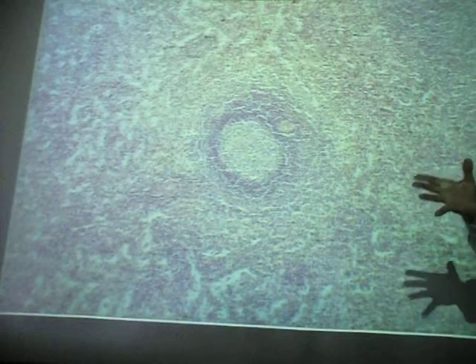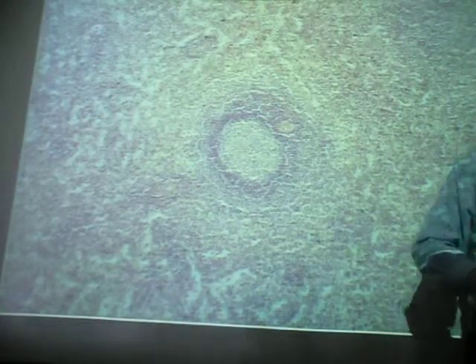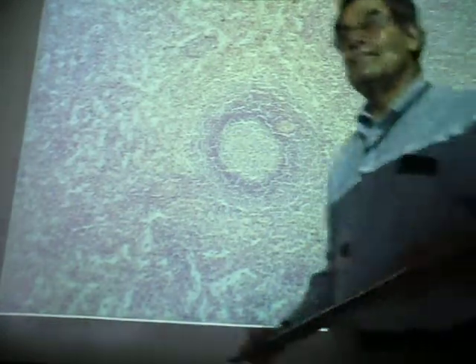What else does the spleen do besides get rid of worn-out red blood cells and filter debris from the blood? What else? I could ask for several functions. Stores platelets and stores iron. Okay, it stores iron, because remember it's breaking down those red blood cells, breaking down the hemoglobin. And it stores iron to be recycled. Immune surveillance. That's why some of you, when you look at those slides, had that brownish stuff in the tissue. That was iron, stored in the macrophage that'll gobble up the hemoglobin.